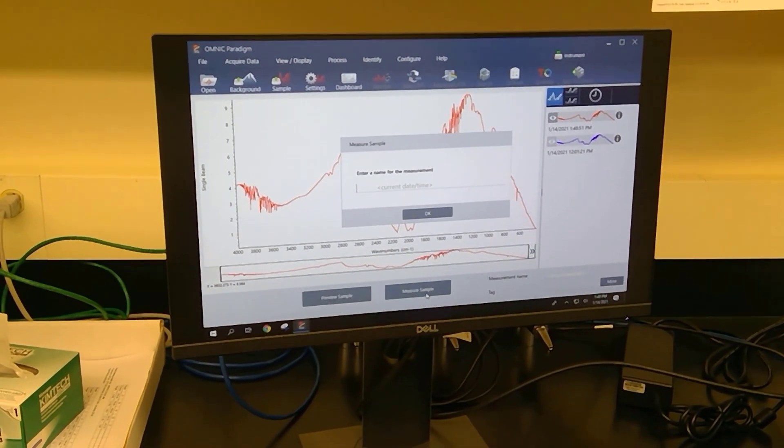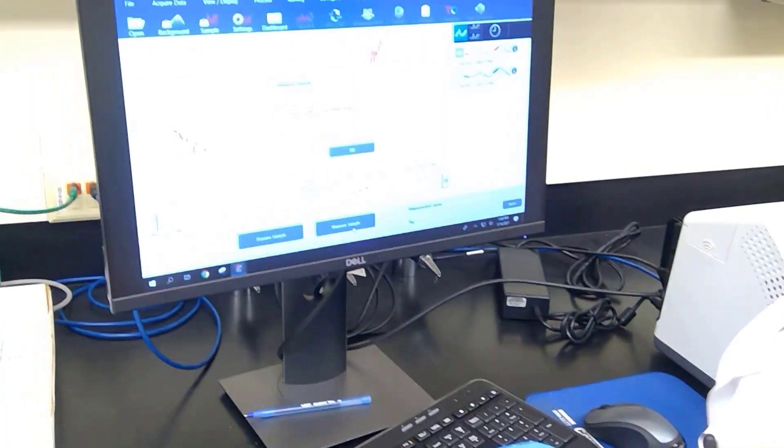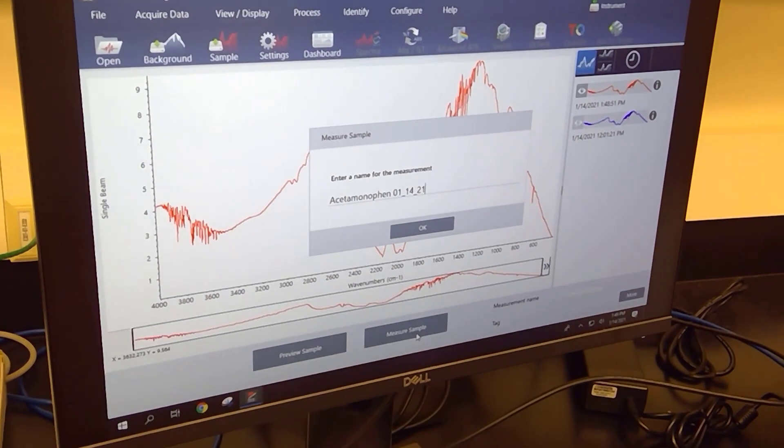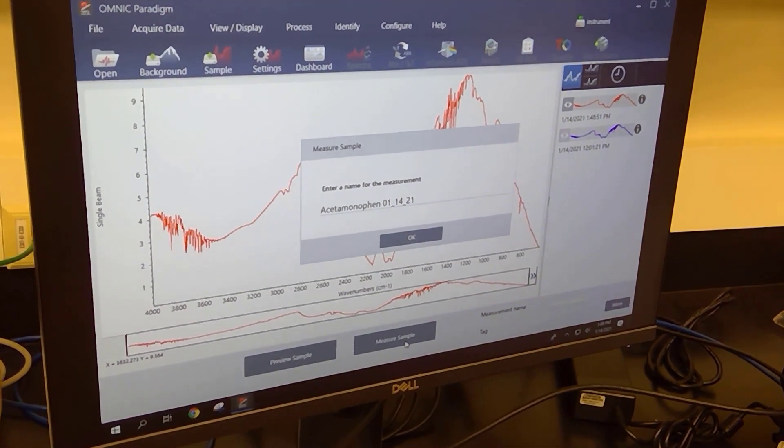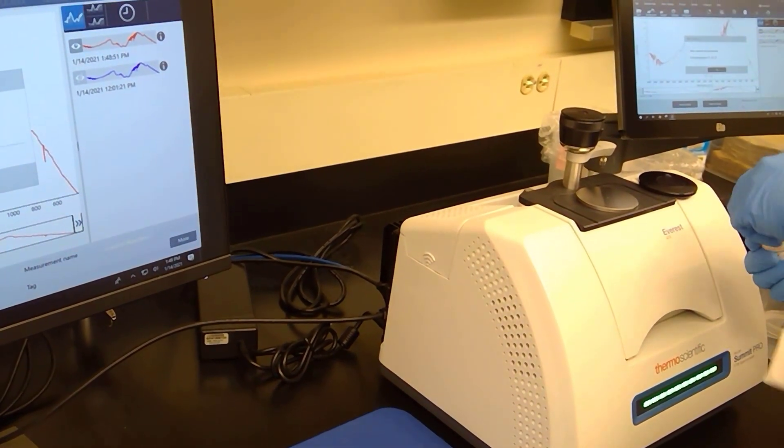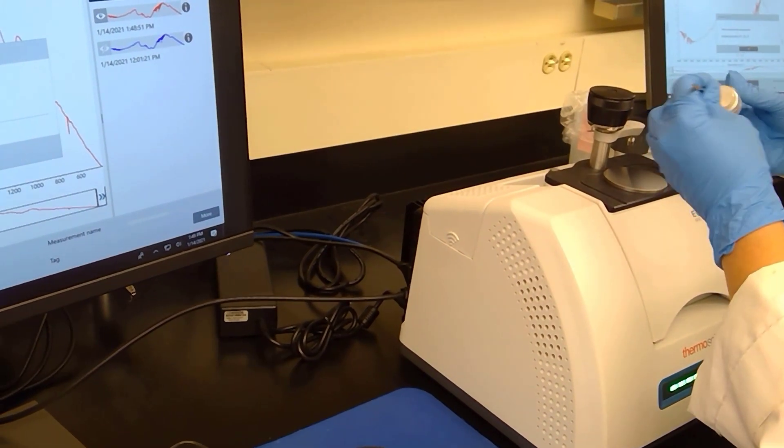We are going to ask the machine to measure a sample. We're going to add in the name here, so I will type in acetaminophen and I'm going to add in a date. Before I click okay, I'm going to add the sample to the sample zone.